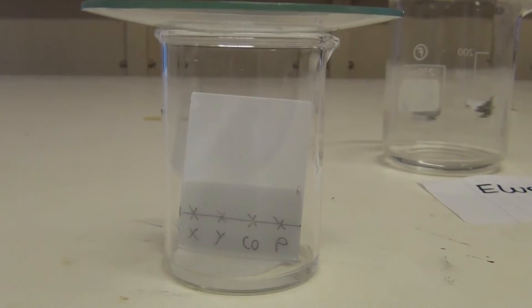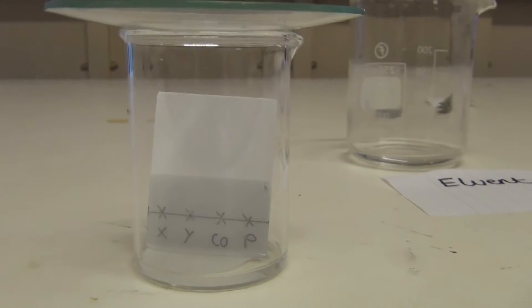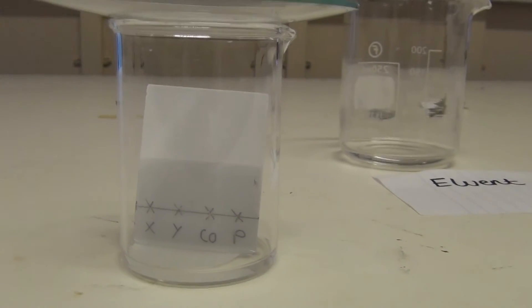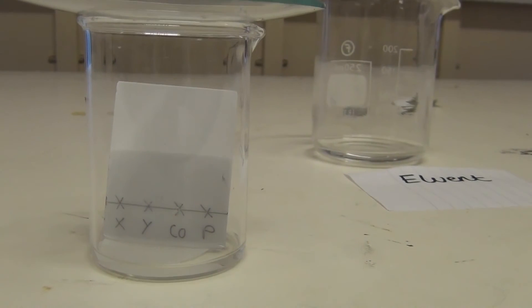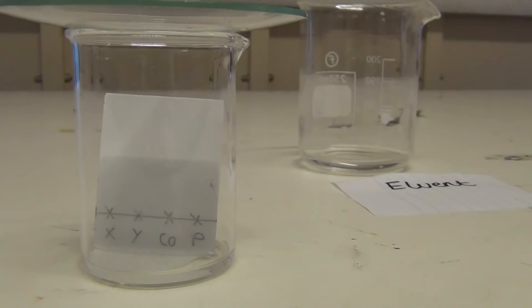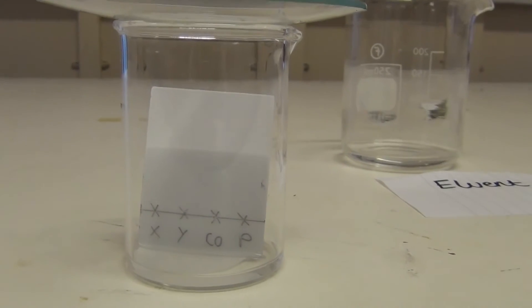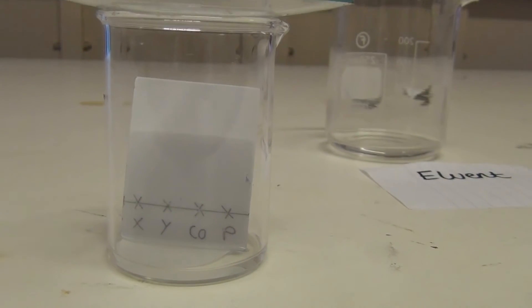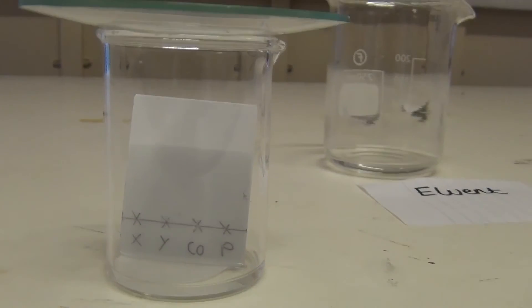TLC works by exploiting the different degrees to which different compounds interact with the stationary phase, as they pass over or through this phase as part of the mobile phase. In TLC, the stationary phase is the silica-coated TLC plate, which you can see in front of you. The mobile phase is the solvent which the TLC plate is placed into and is what causes the compounds to run up the plate.